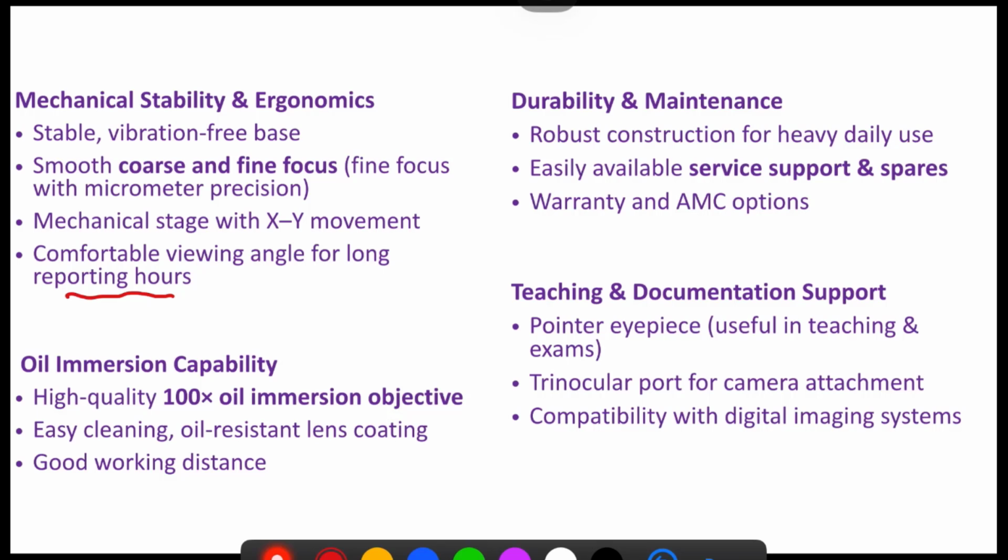Durability: robust construction for heavy daily use, easily available service support, and spare parts are very much needed. Warranty and AMC options are very important.